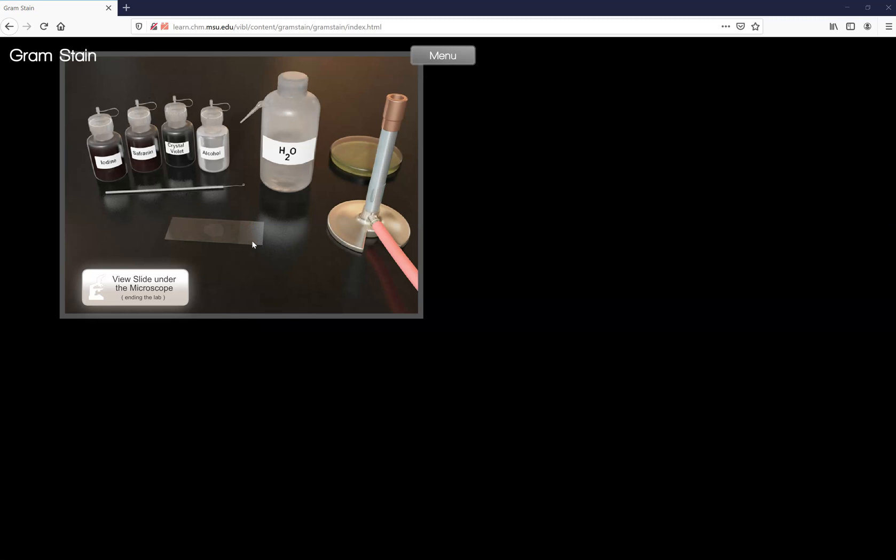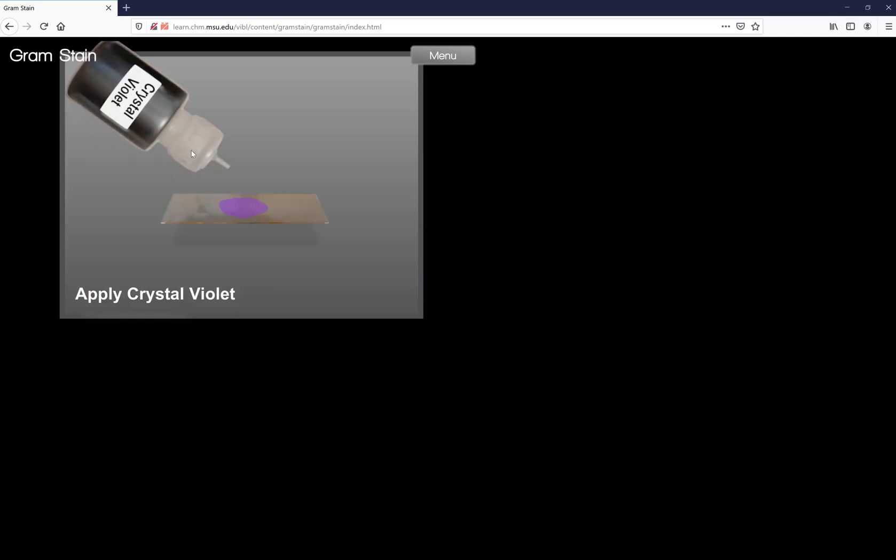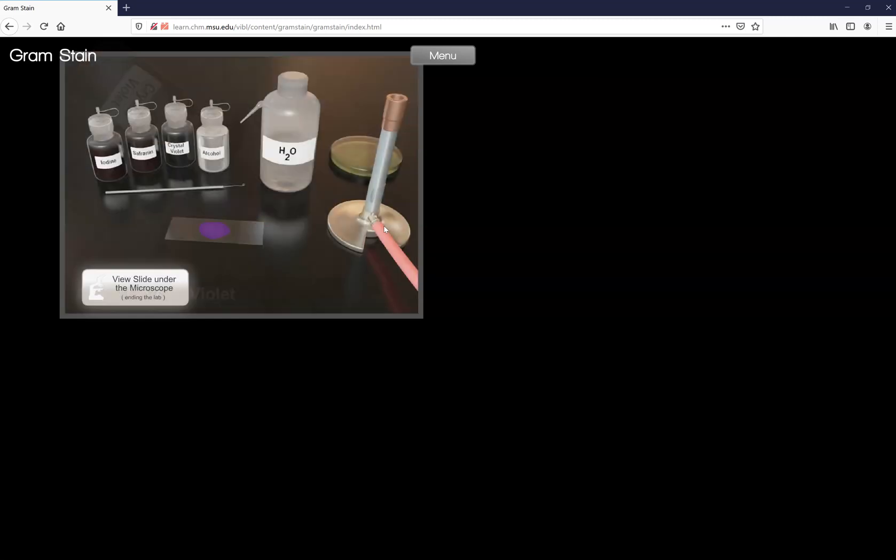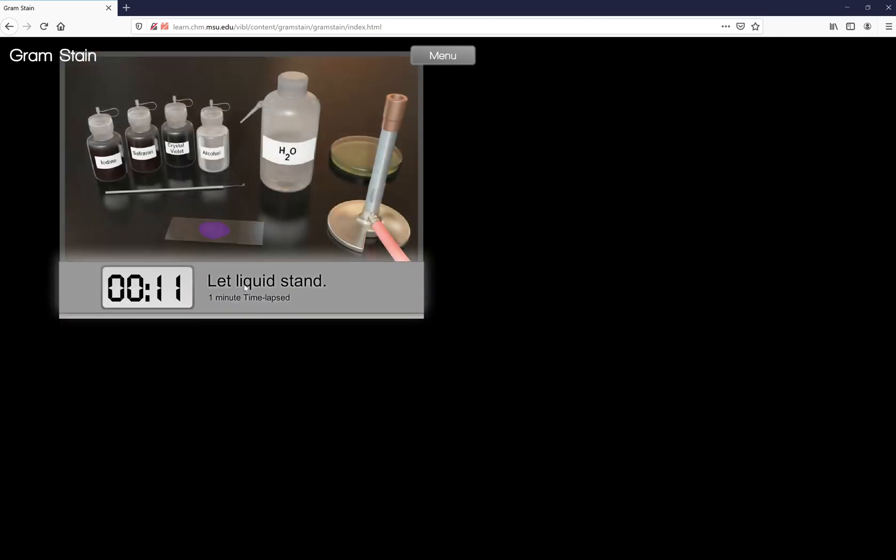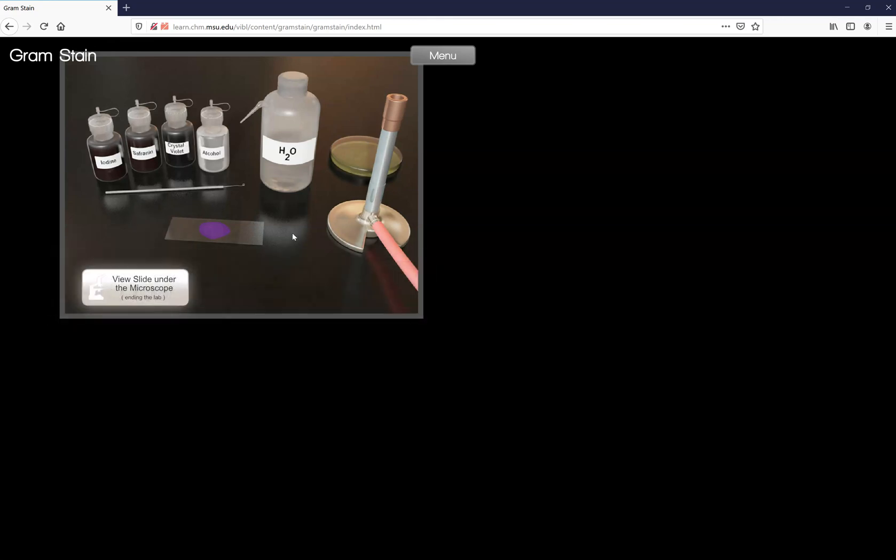Now that you've heat fixed your slide for about one to two seconds, the first stain we're going to use is crystal violet. So click the crystal violet to apply it. That will automatically time it for you. Crystal violet has a bluish purple tint and it's going to stain everything, gram positive and gram negative bacteria.